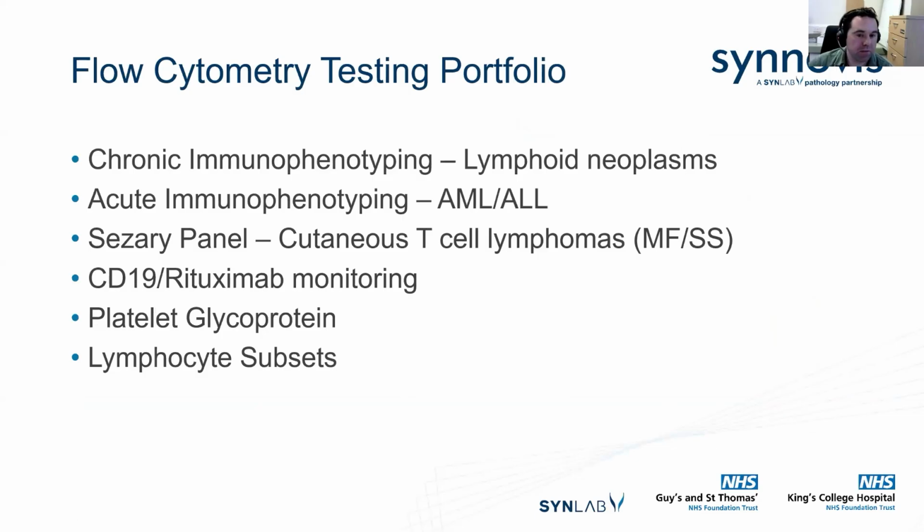So we have a diverse testing portfolio at Guy's. We do chronic immunophenotyping for lymphoid neoplasms, acute immunophenotyping for diseases such as AML and ALL. We run a Sézary panel for cutaneous T-cell lymphomas. We do CD19 and rituximab monitoring. We run platelet glycoprotein tests, and we also do lymphocyte subsets.